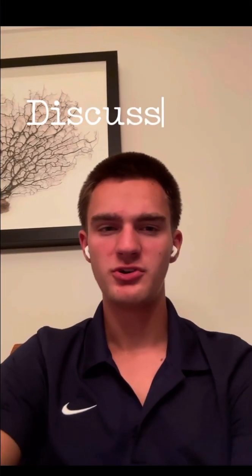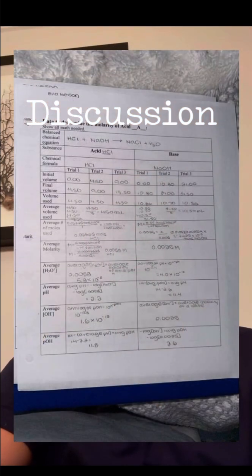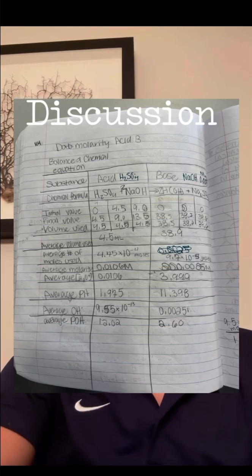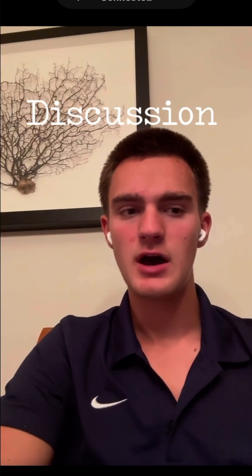Our titration results show that the unknown concentration of the acid was very similar to the data collected by other scientists, which suggests that the procedure was accurate and consistent across all the scientists doing the work. The consistency supports the reliability of the method used and indicates that most of the scientists followed the procedures correctly. Some sources of error may still have affected the final values.